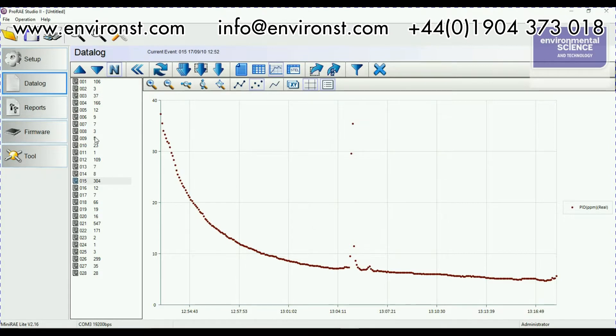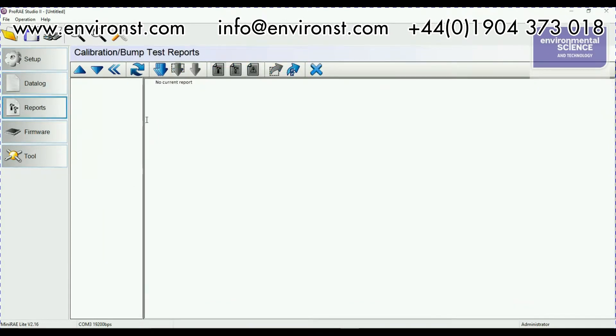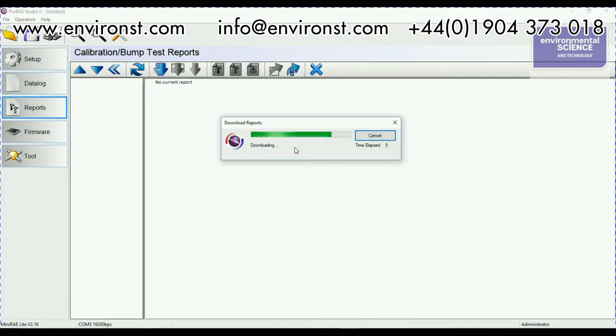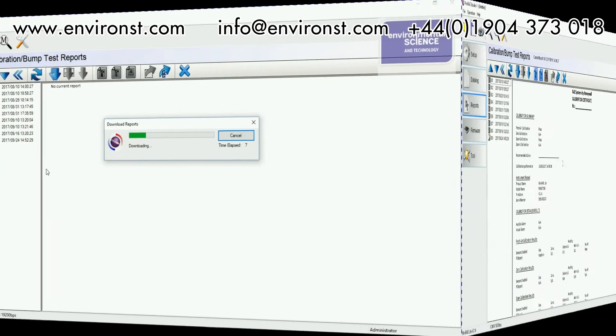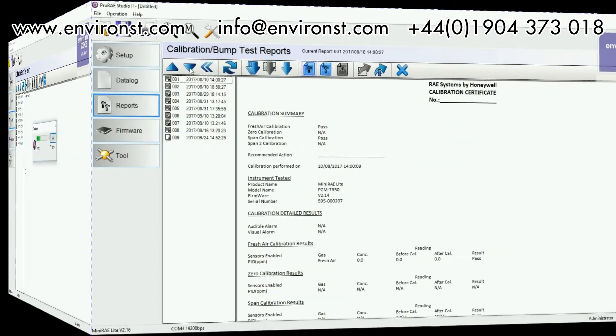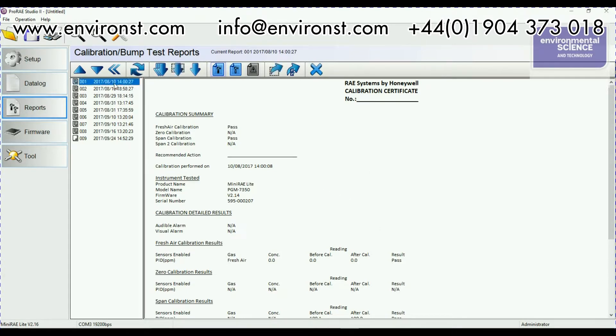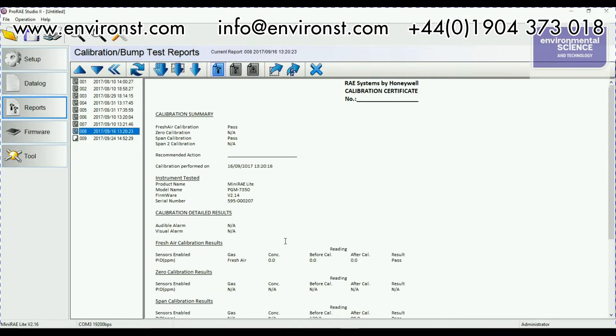So the other things that we can be doing if we click into reports here and I download reports and this one's got not too many reports in it which is good makes life easier. Basically under your reports here this is where you can download your calibration summary. So this unit has been calibrated quite a lot recently because I've done a fair few demos with it.